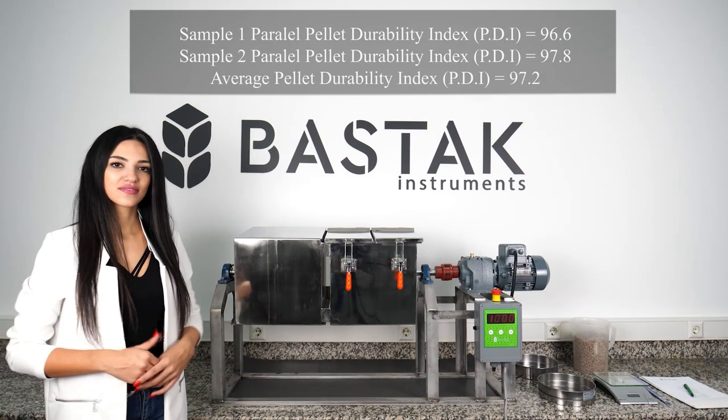Sample 1 parallel pellet durability index, PDI, equals 96.6. Sample 2 parallel pellet durability index, PDI, equals 97.8. Average pellet durability index, PDI, equals 97.2.